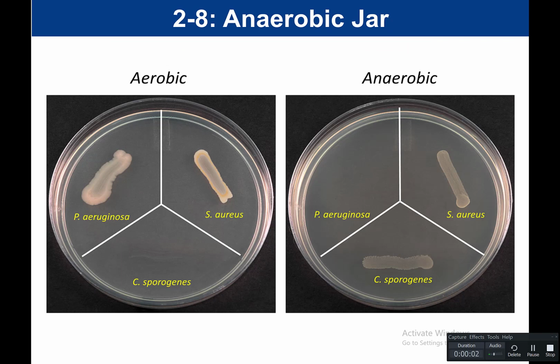So here are results for the anaerobic jar experiment. On the left, we have our aerobic plate, meaning this was the plate that was grown with O2 present. This is the plate that was grown in the incubator.